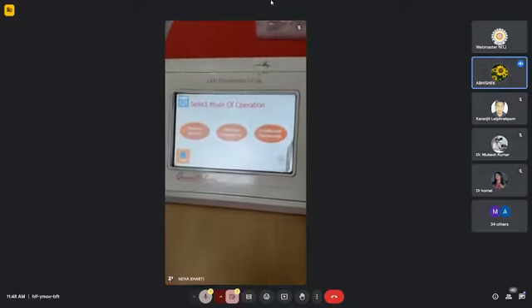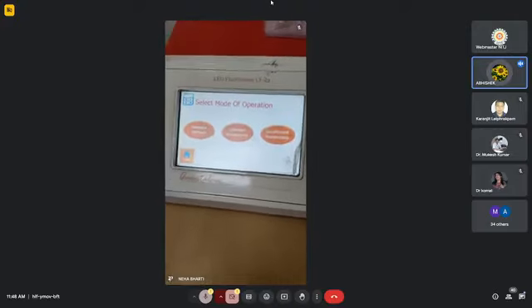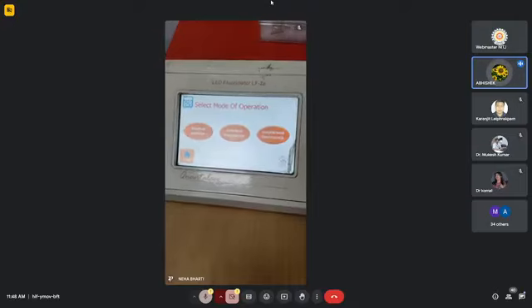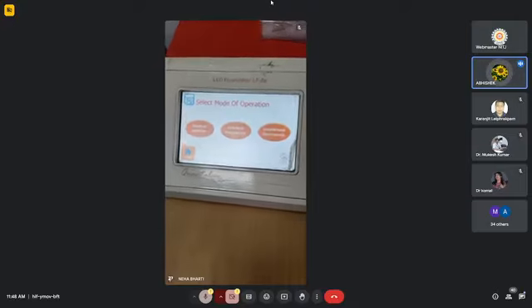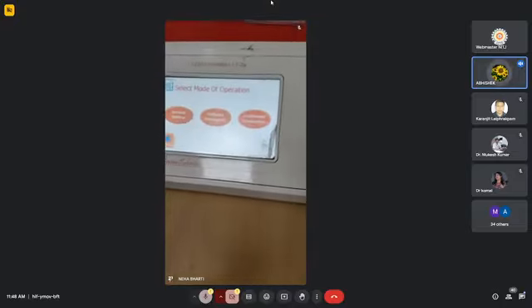Second is calibrated fluorescence mode, in which the instrument is first calibrated by the fluorescence of a known standard, and later when measurements are carried out on samples of unknown uranium concentration, the instrument uses the calibration factor measured and calculated earlier.